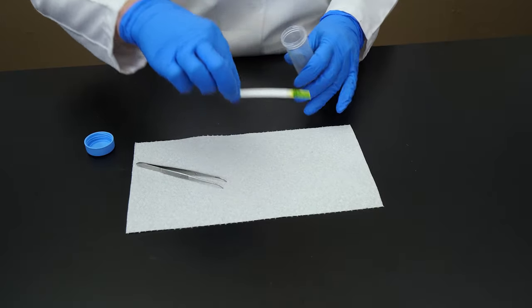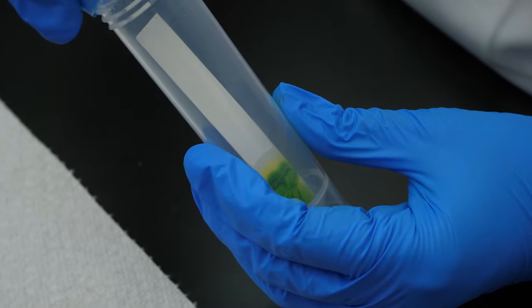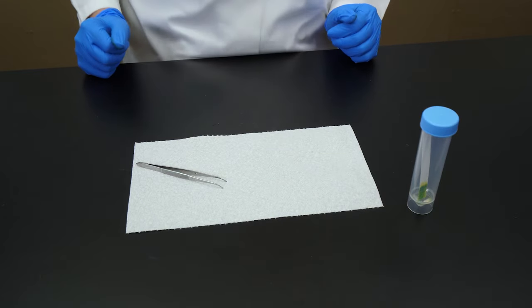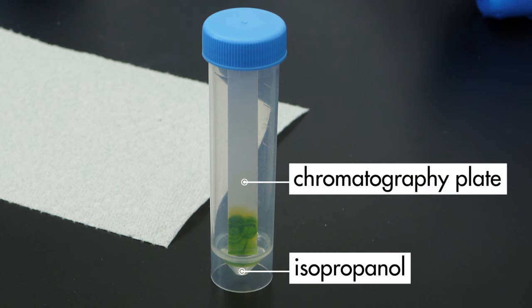After four minutes, we place the chromatography plate in a vial containing a small amount of an organic solvent called isopropanol. The plate will act like a wick to draw the solvent to the top of the plate.